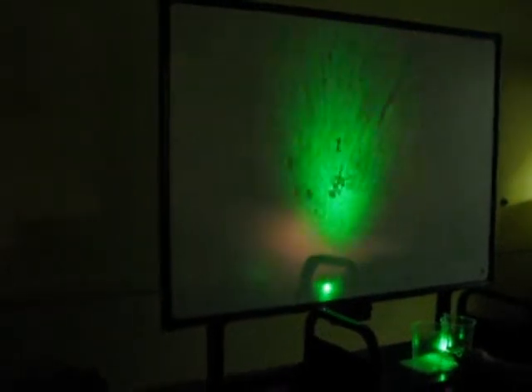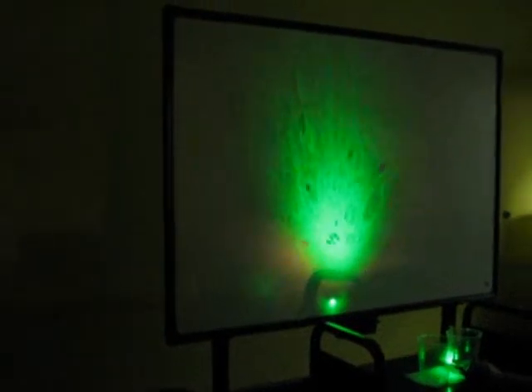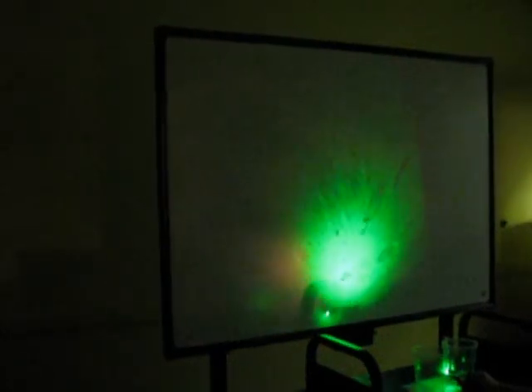Would that work with the regular laser pointer? No. Oh, what's up to the top right? That might be parameciums. I can't tell. No, they're not. This is pretty good. See these things stretch out. Cool. What's up to the top right now?